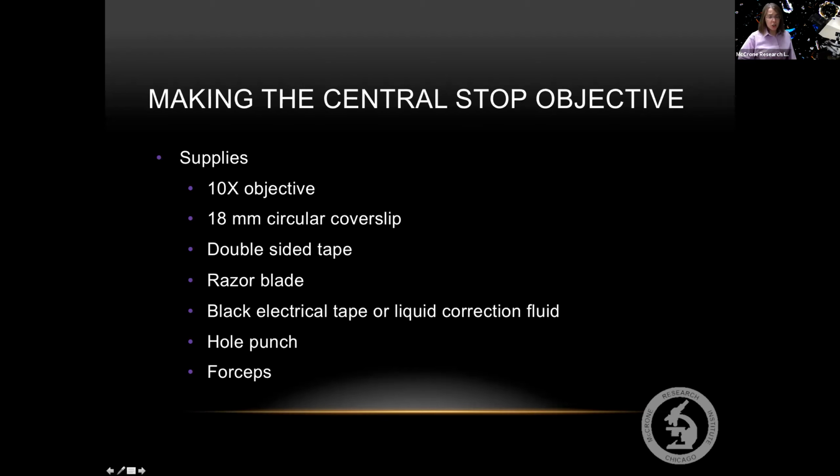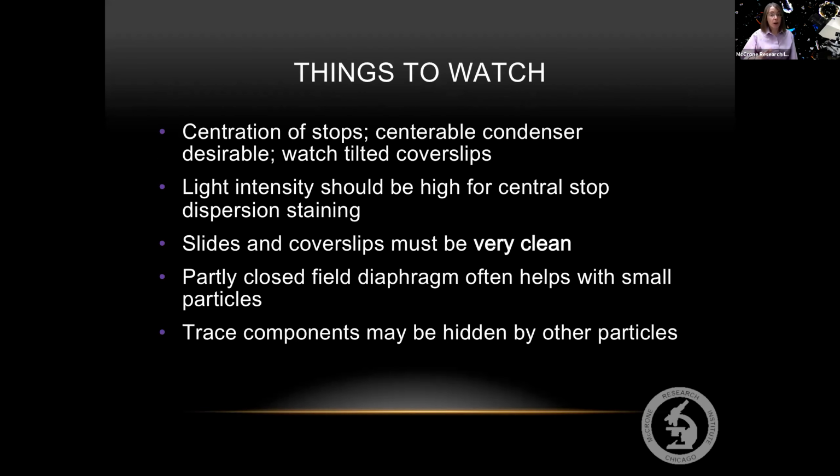And I just want to make sure people are aware of some things that we need to pay attention to with dispersion staining. Of course, getting that stop centered is really important, and making sure that you have a well-prepared sample. So I say here, watch out for tilted cover slips. When you're preparing a sample, you really want to make sure that the entire area underneath that cover slip is filled with liquid. You'll probably have to turn up your light intensity, and of course, everything needs to be very clean. I can't stress that enough.